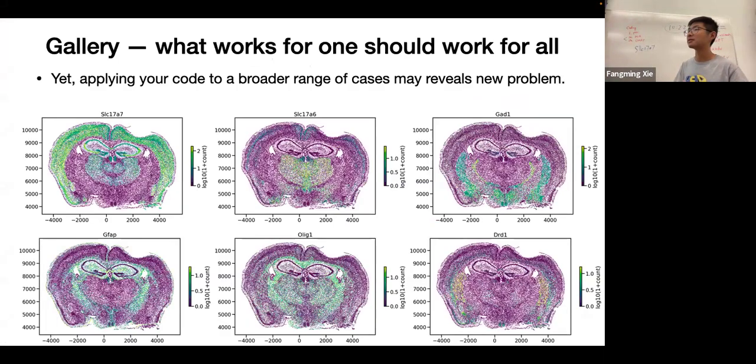The nice thing about coding: you may take a while to figure out how to do even something simple, like plotting a gene, but you just need to figure it out once and for all. If you figure out how to do it with one gene, one data set, you automatically know how to do it for all genes in all data sets effortlessly. Next time you just copy and paste the same code. If you organize your code a little bit, then next time you just apply it.